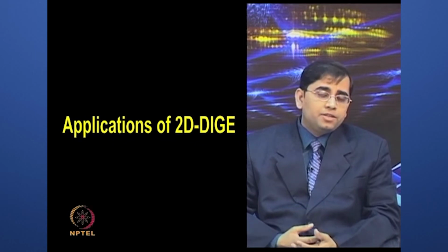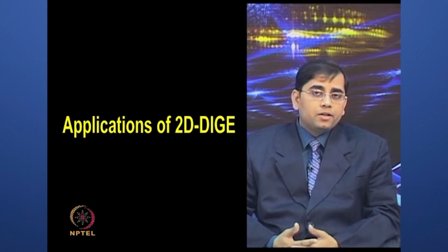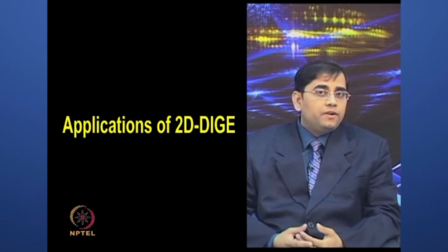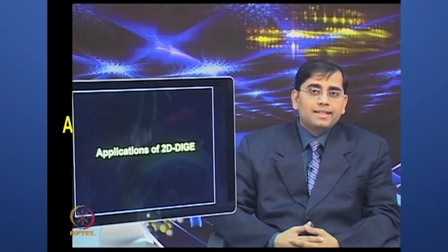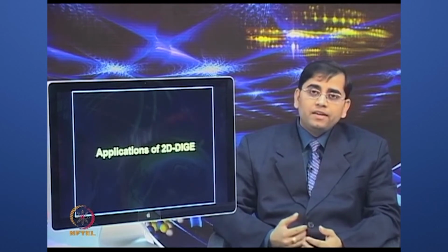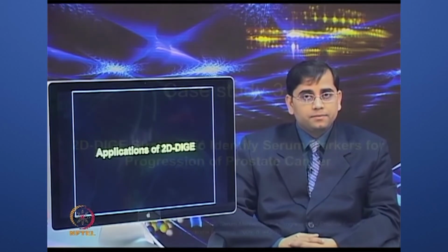If you see the recent publications, you will appreciate there are several papers on each of the biological systems for different types of applications, whether it is cell signaling, developmental biology, plant proteomic analysis, neurosciences, clinical studies, or different types of diseases including cancer. You will find there are hundreds of publications available which have employed the power of the 2D DIGE technique.